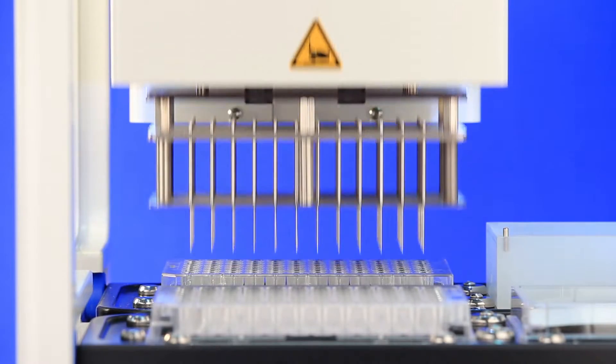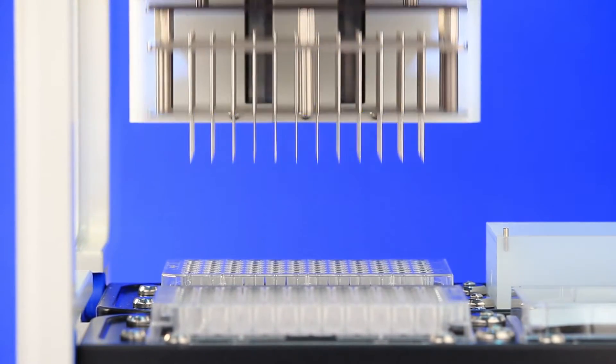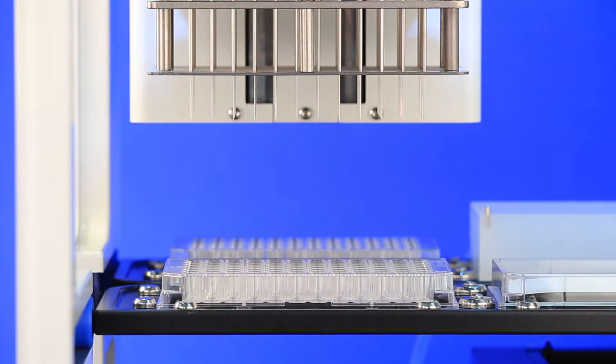First, the pin tool is dipped into the source plate three times. Dipping three times ensures proper coating of the pin.